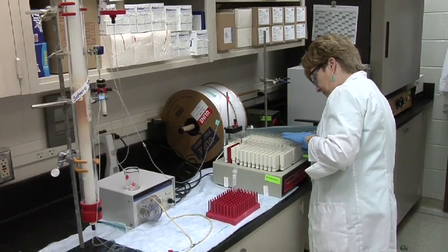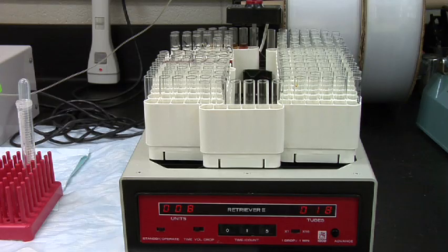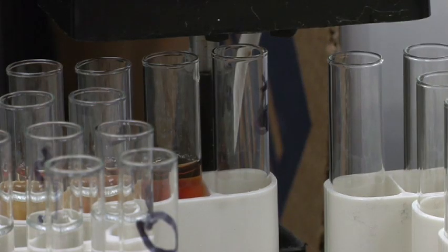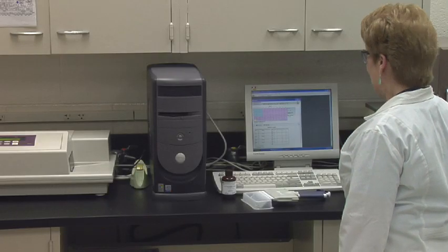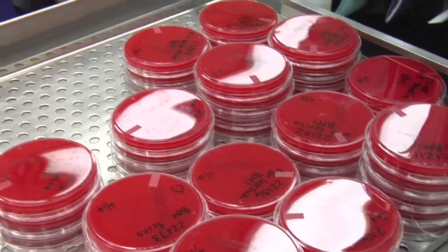The lab has also developed ferritin assays for cats, dogs, horses, primates, rhinos, fur seals, dolphins, and tapirs. These assays detect increased values of total body stores of iron associated with infections, cancer, and acute phase reactions.